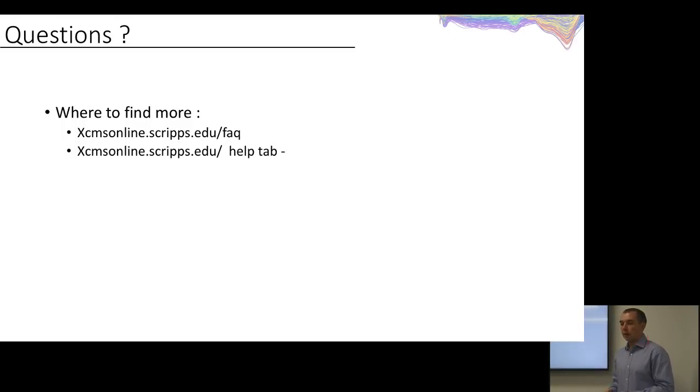So it's better to set it ever so slightly wider than narrower. If you set it too wide, then the algorithm will have to make a decision whether it goes left or whether it goes right. But I'd rather it have to make that decision than not find your trace in the first place. The other thing to remember as well is this is not scan-to-scan variability at the top of your peak. This is scan-to-scan variability at the bottom of your peak as well.